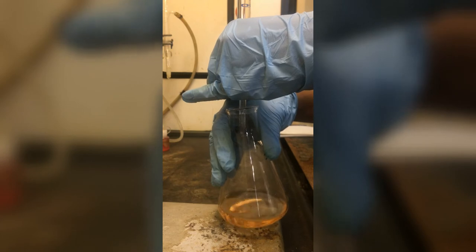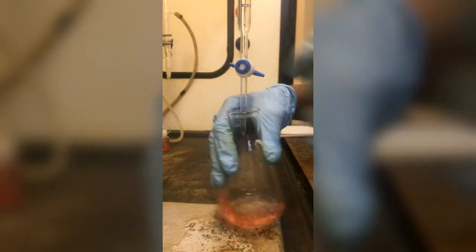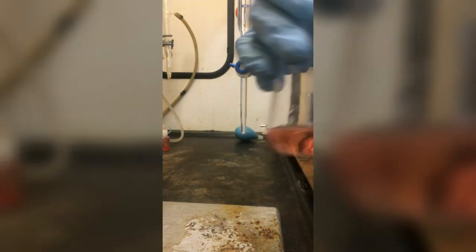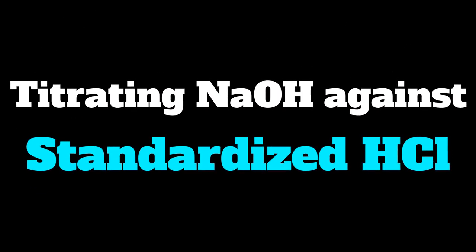After we have reached the color change, we take our final reading. And of course, we do this in triplicates. Now, we will titrate the NaOH solution against the standardized HCl solution.